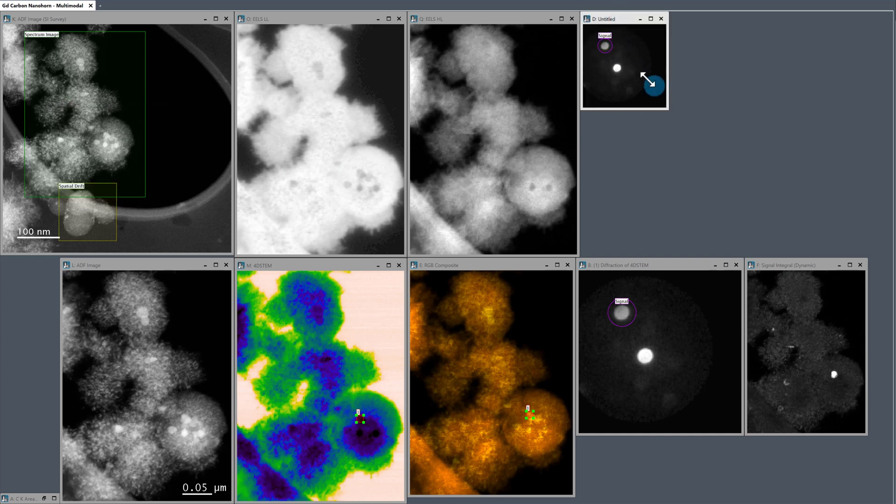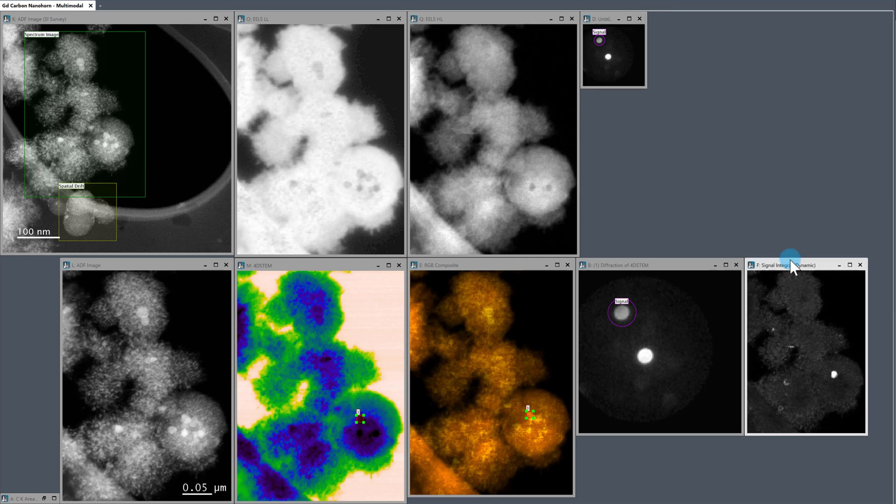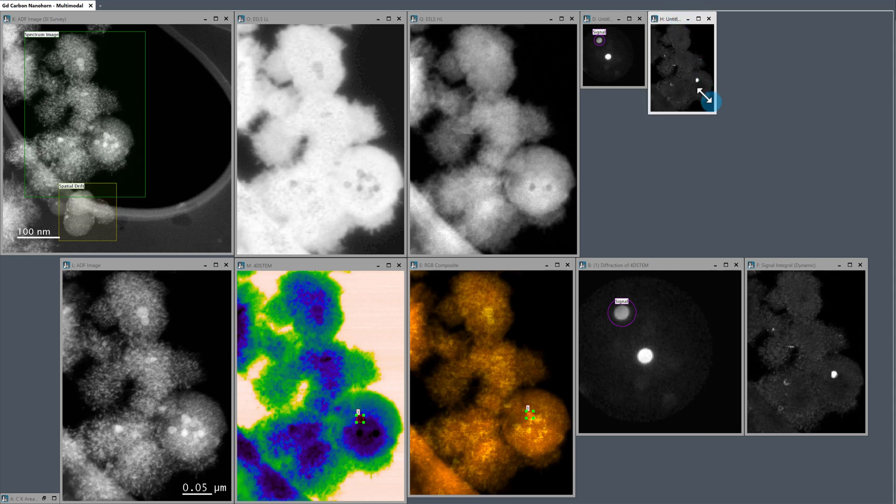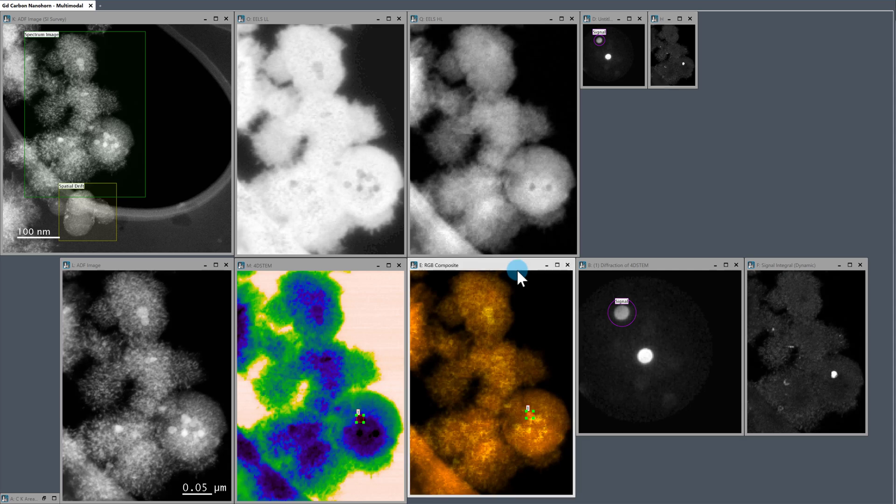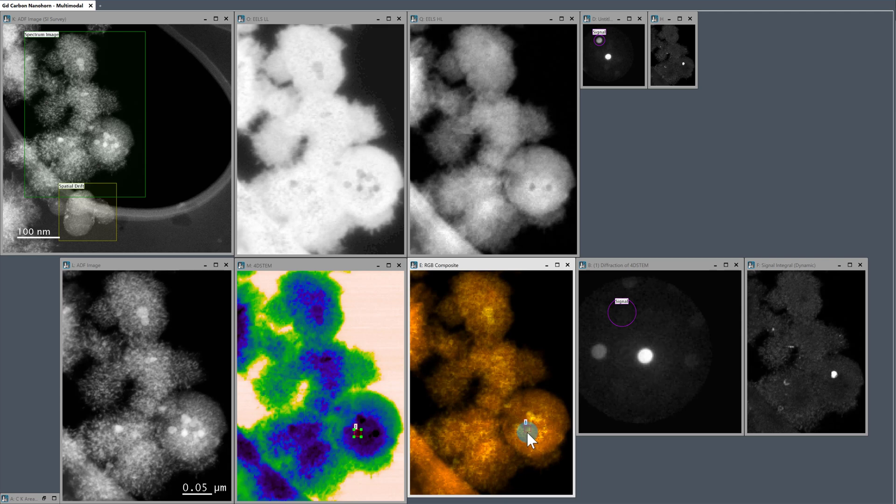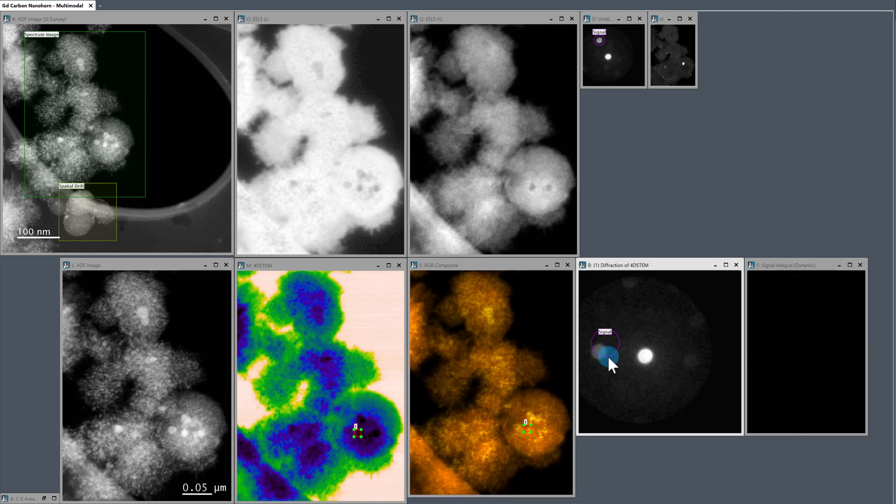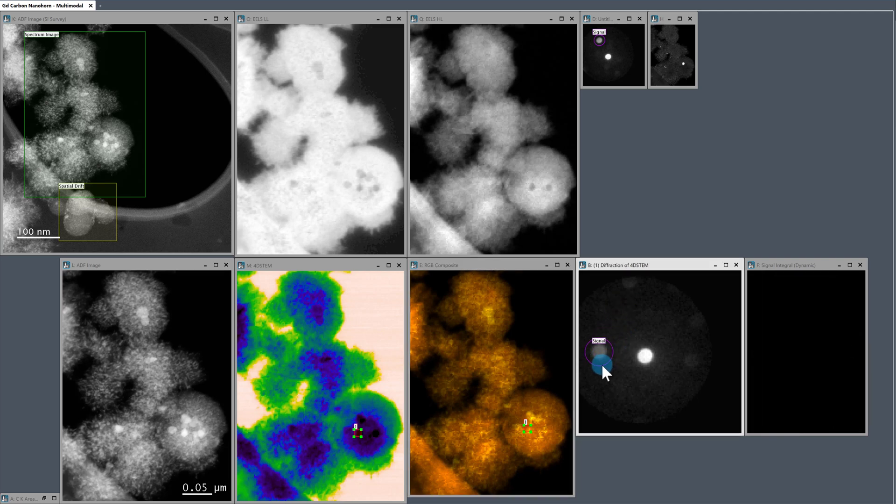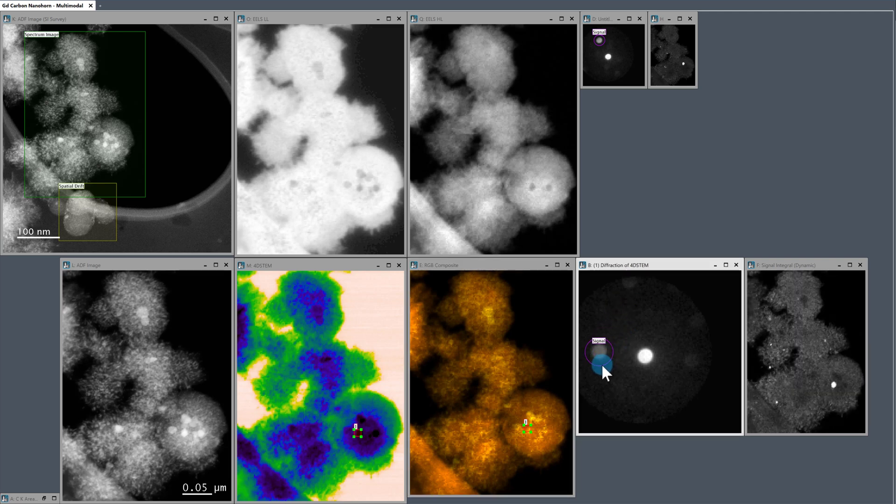I'm going to place that there temporarily. And now we can then start moving around. So let's look down at this particle. And we see that we have this diffraction disk, which is high intensity in this region, that wasn't high intensity in the other regions. So we can move our virtual aperture to this new diffraction disk. Duplicate this other virtual dark field image.